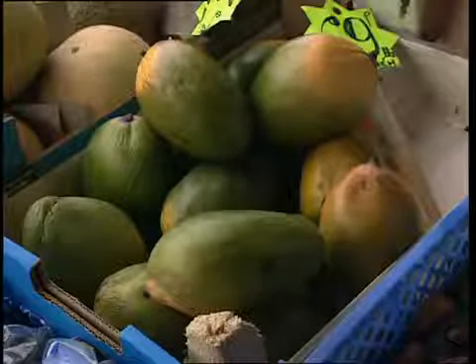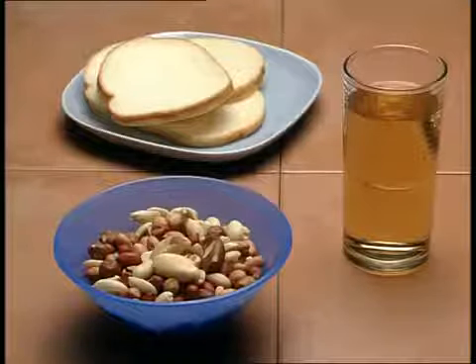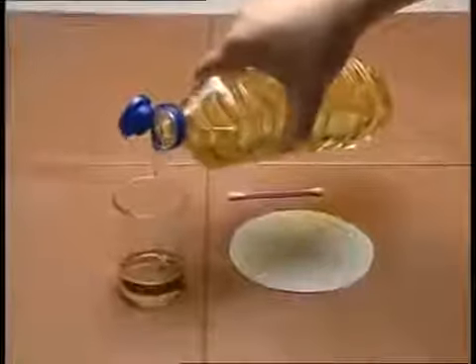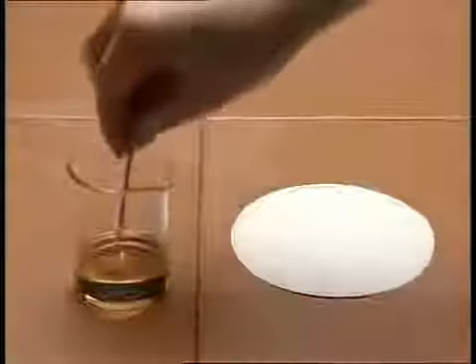To find out whether a food contains fat, carbohydrate or protein, there are some simple tests. We'll be testing bread, nuts and grape juice. The first test is for fats. Vegetable oil is 100% fat.